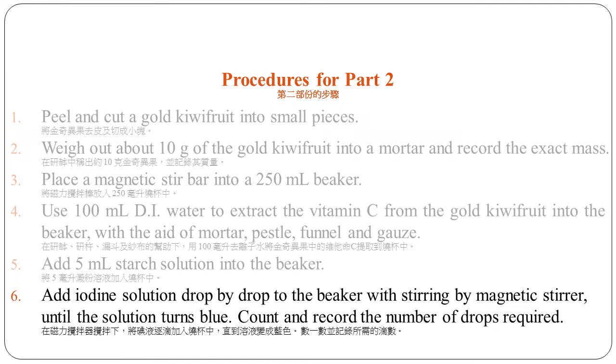After the preparation of the extraction of gold kiwi fruits, we need to add iodine solution drop by drop to the beaker with stirring by magnetic stirrer until the solution turns blue. Count and record the number of drops required. Let's see a video.